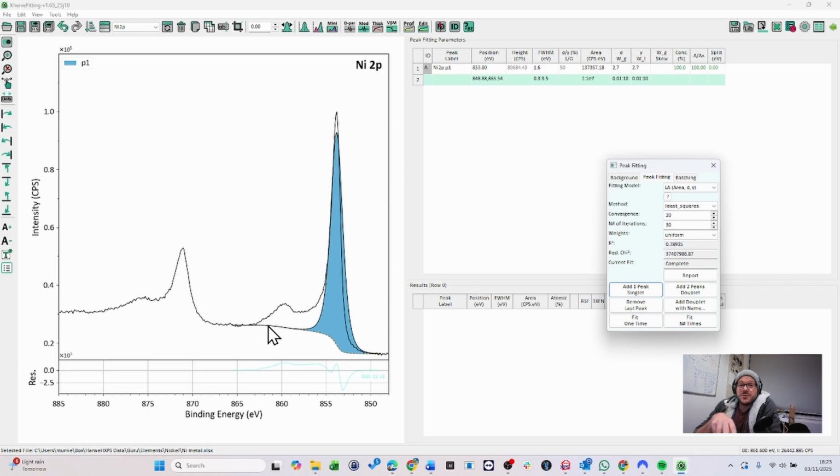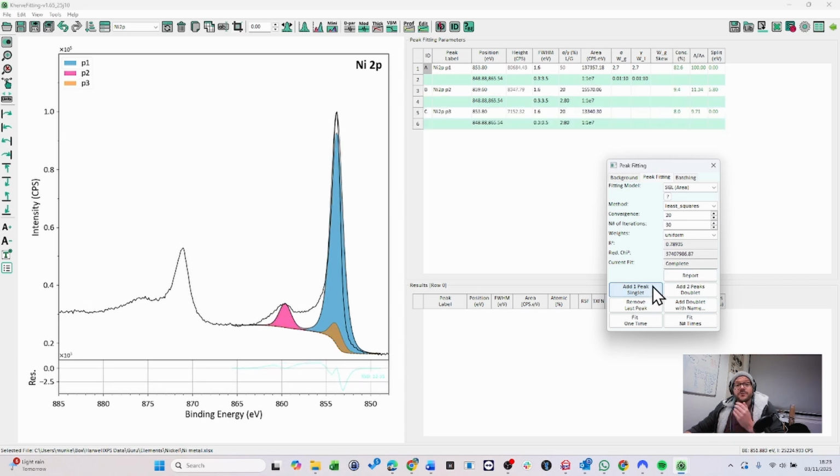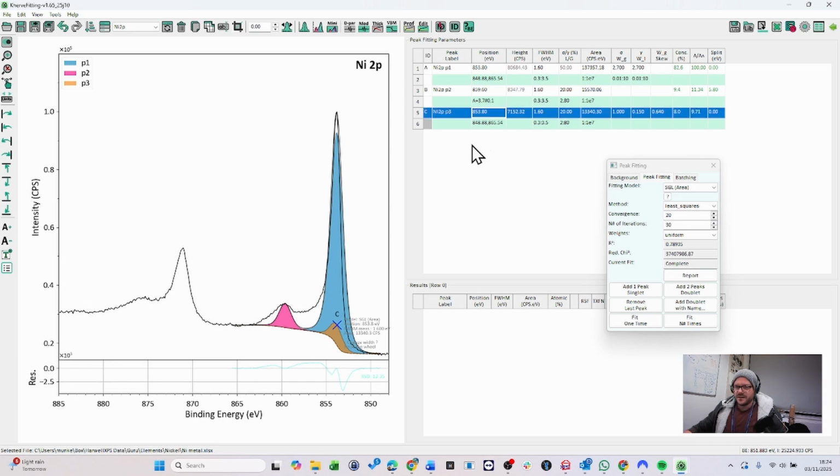Some of the peak models that you can use for things like nickel can be found there, with all of the information that you'll need. That's what I'm using as a basis for this fit. So I've added one peak, and I'm going to go back and just add two more, which are going to represent the bulk and surface plasmons. And I can use the same locking parameters as before. In fact, we can give ourselves a little bit of fitting grace here.